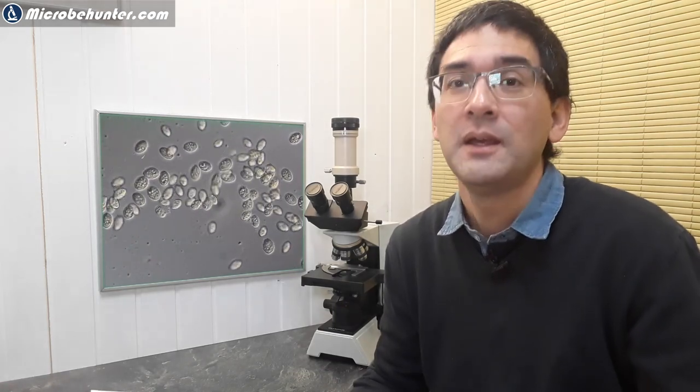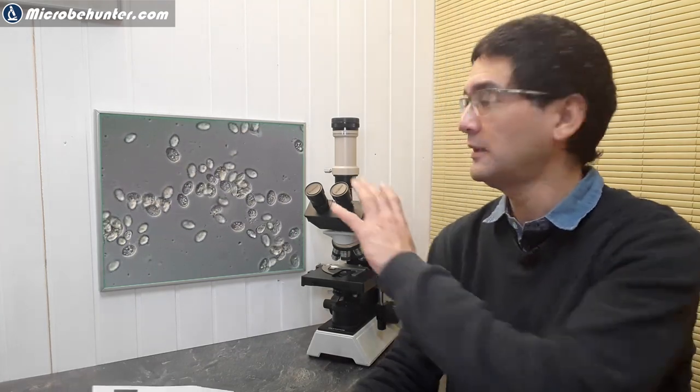However, it is also possible to directly connect a microscope camera. This is the option if you do not have a microscope with a photo tube. Because of weight reasons, you can also connect these cameras directly to the eyepieces, a significant advantage. And here you need to connect it to a computer, so this might also be something that you have to take into consideration—you need a little bit more space.